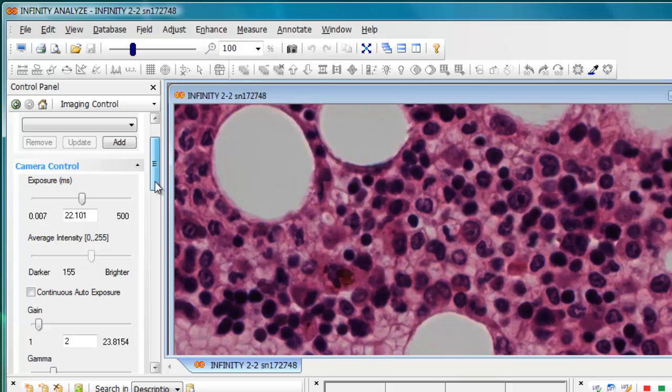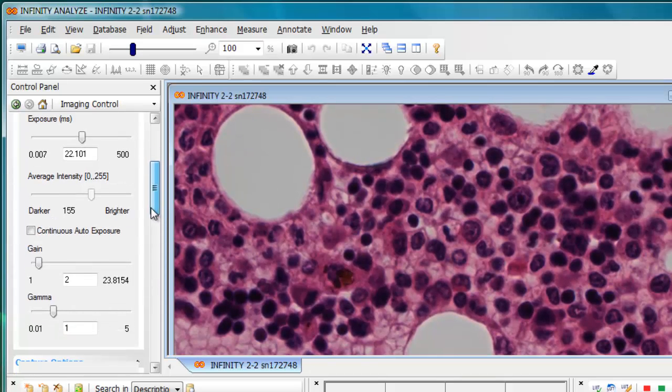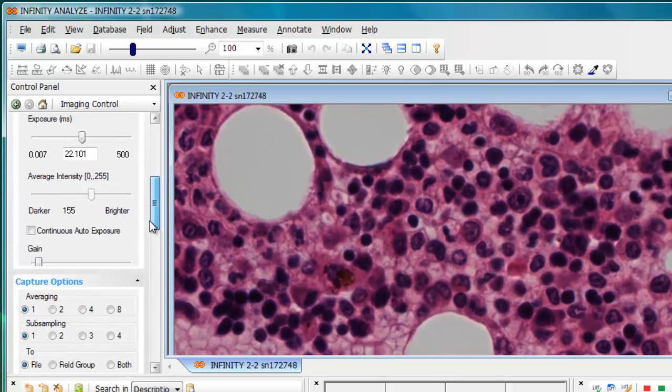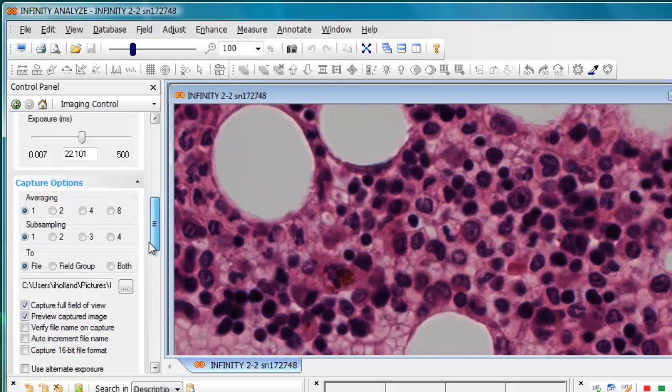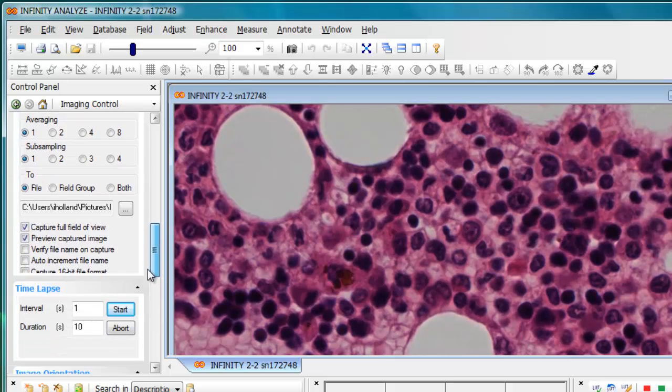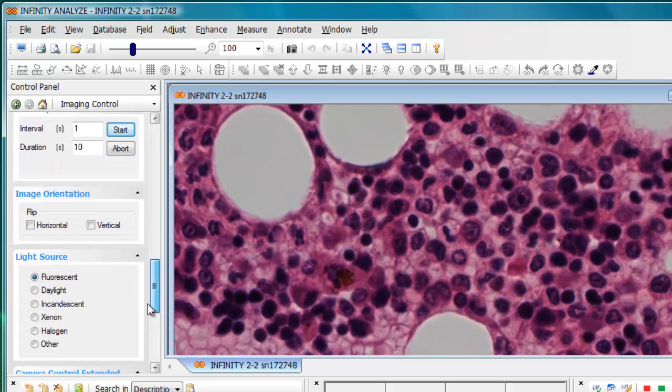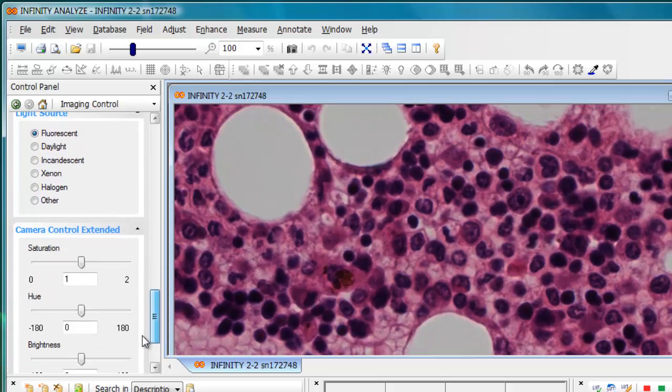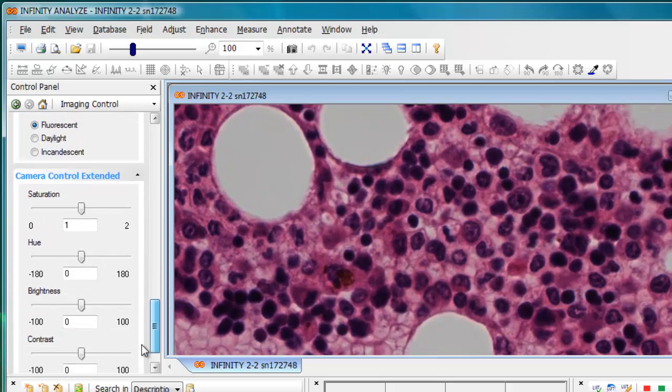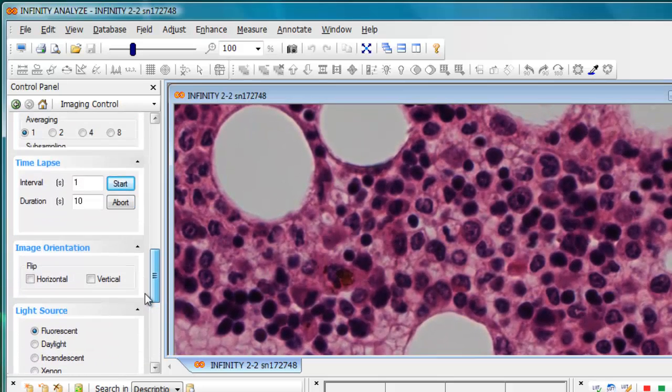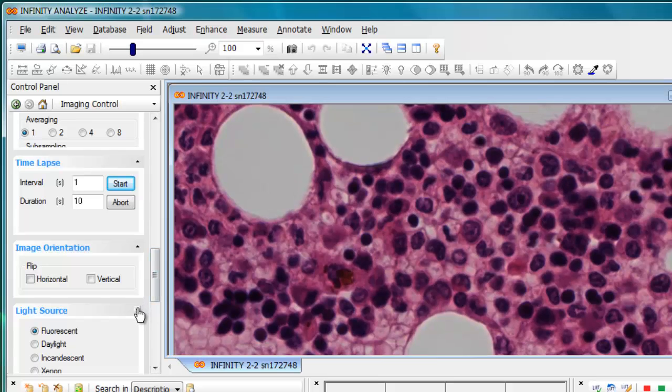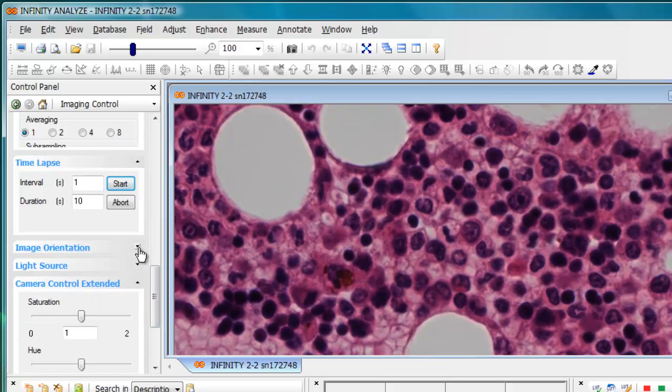The camera controls and capture controls were available in simple mode while capture options, time lapse, image orientation, light source, and camera control extended functions were hidden. Each of these individual items can be collapsed simply by clicking on the small triangle.